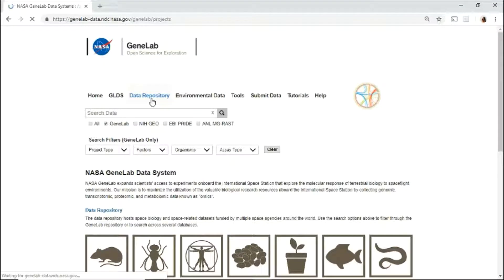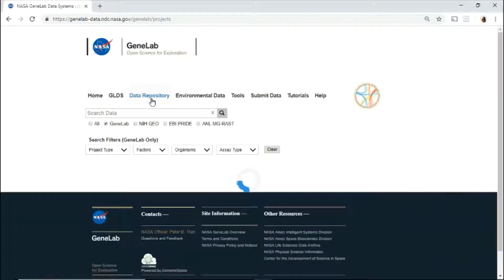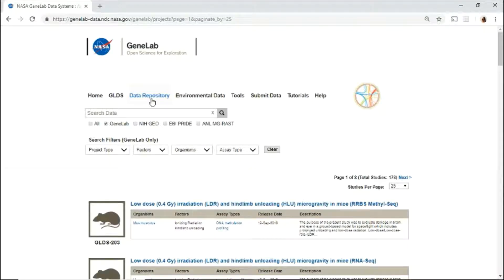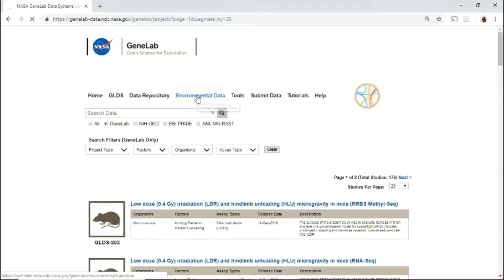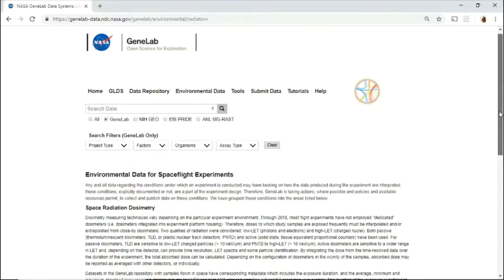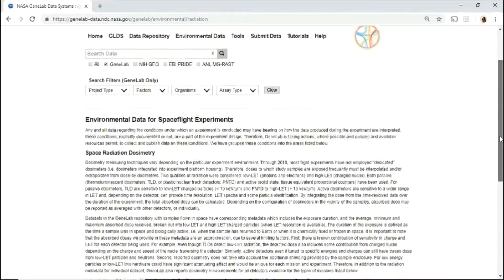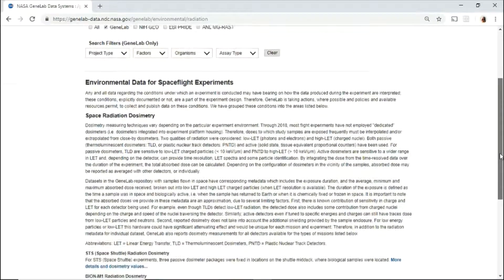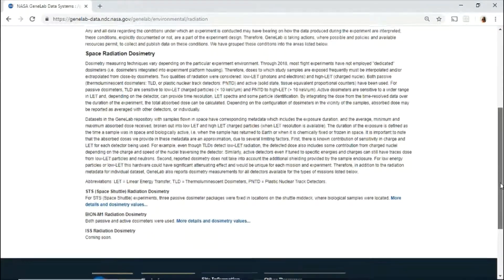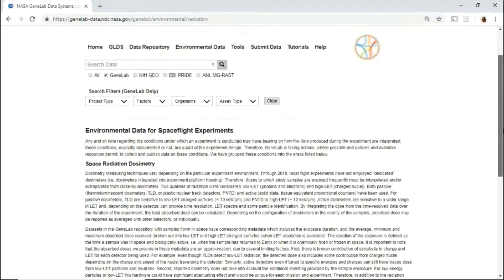The data repository hosts all the public spaceflight and space-related data sets in the GeneLab database. The environmental data page includes data from spacecraft or payload environment for spaceflight experiments. Currently, you'll find radiation dosimetry data that is available for spaceflight data sets.